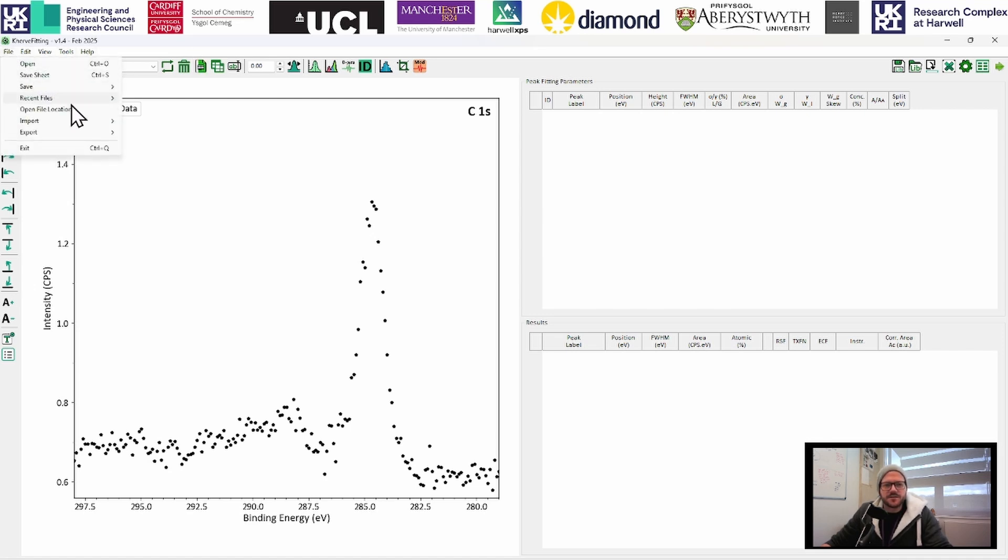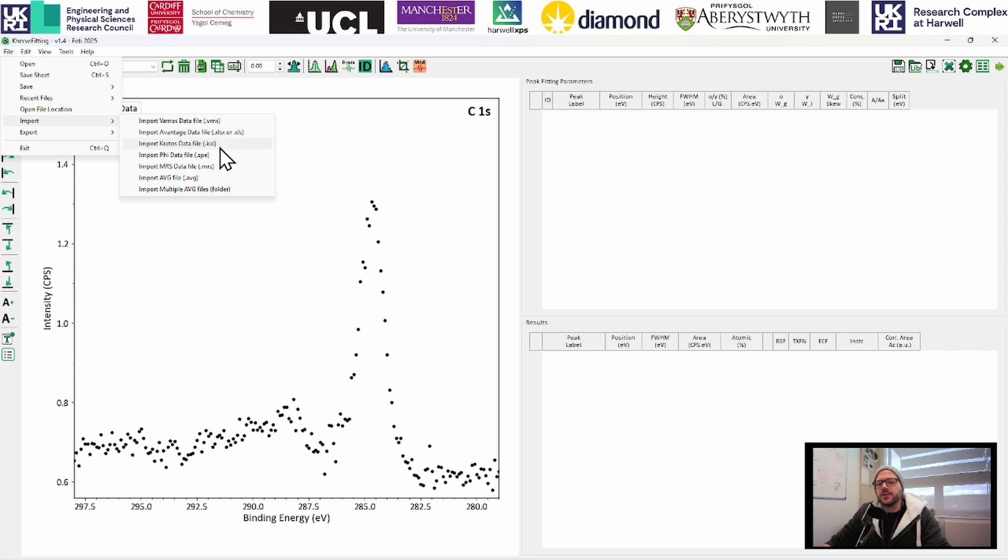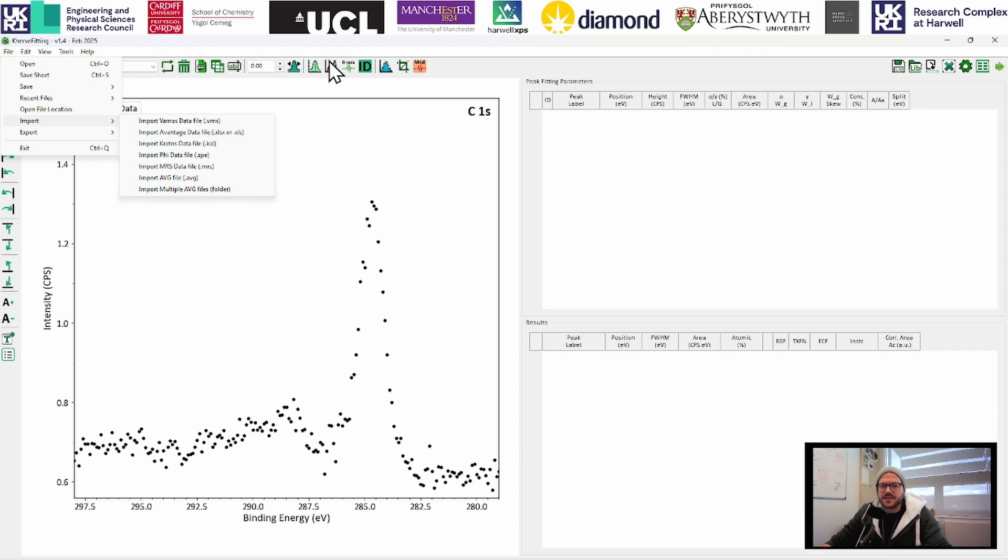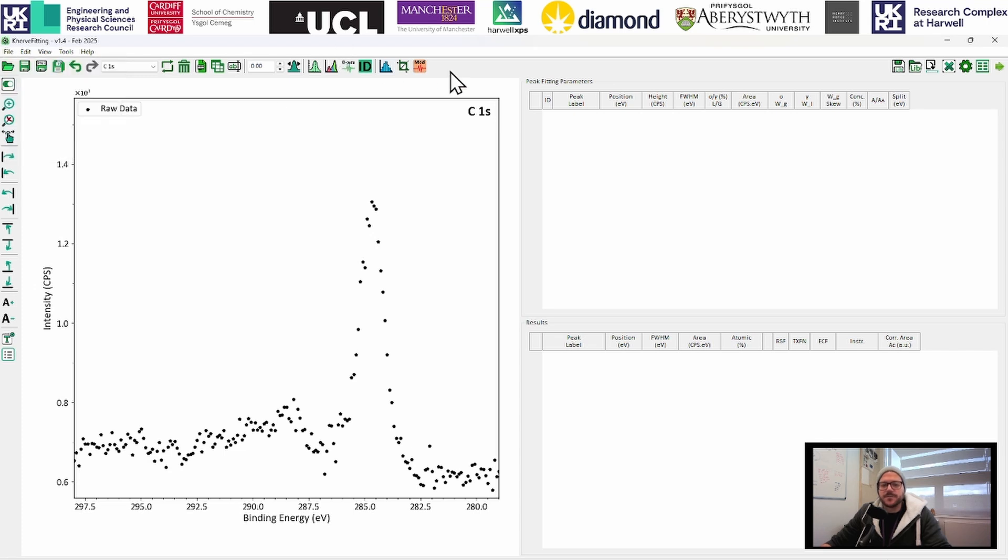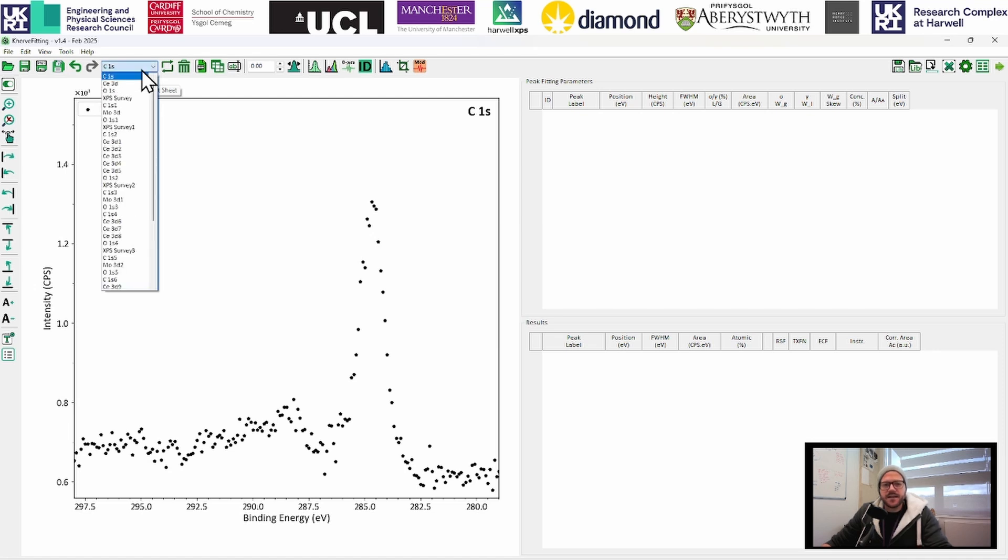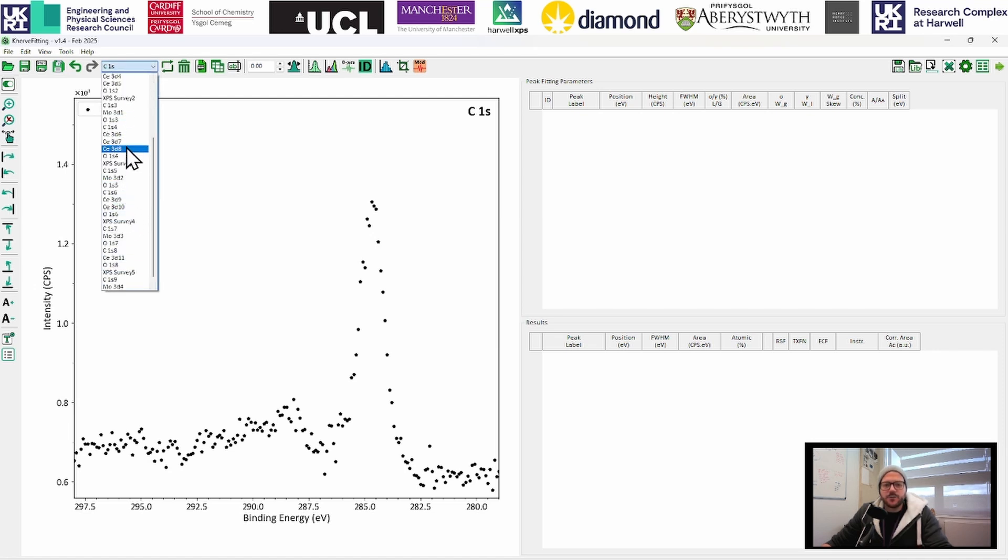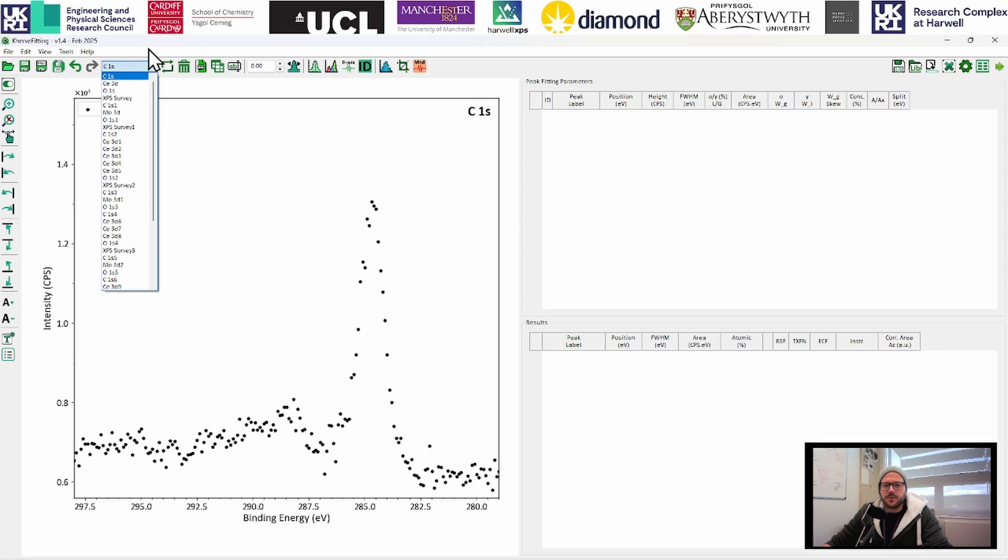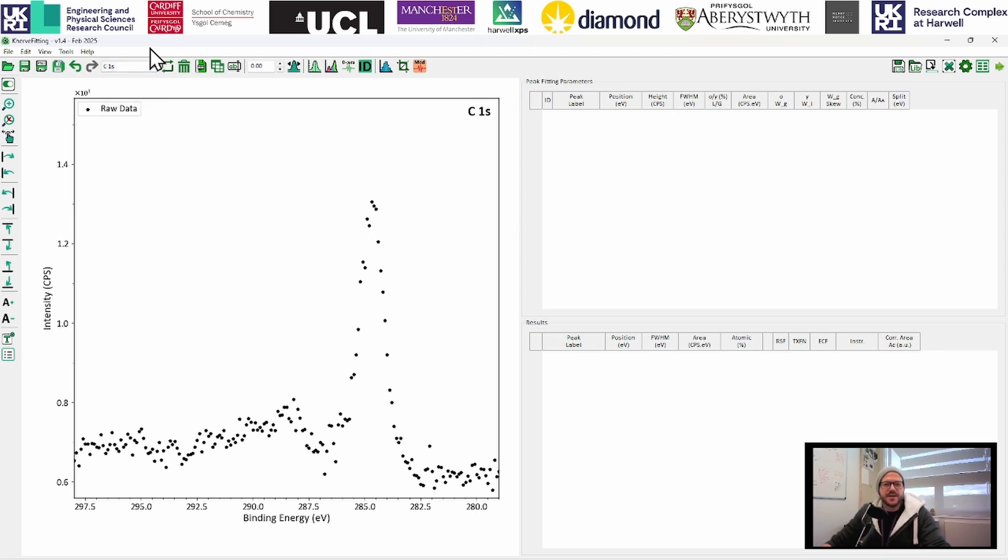If you go into File and Import, you can bring in all kinds of different file types. You've got VAMAS files, Kratos library files, Avantage data, etc. Curve Fitting can handle all of them. And what you'll find up here is a little drop down menu, which shows us all the different blocks that we've just loaded from this file. Nice and easy to navigate.